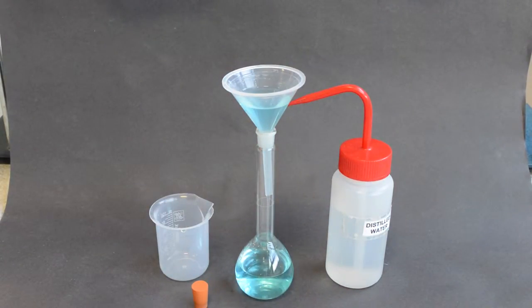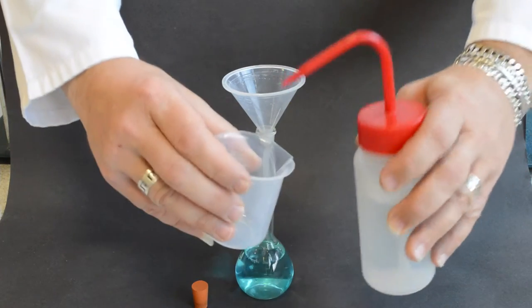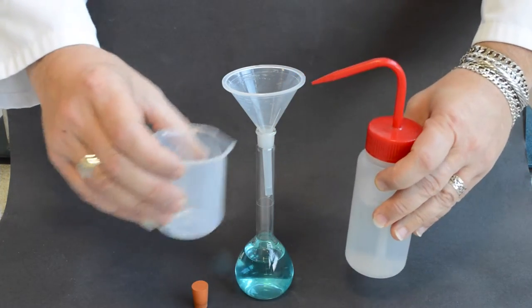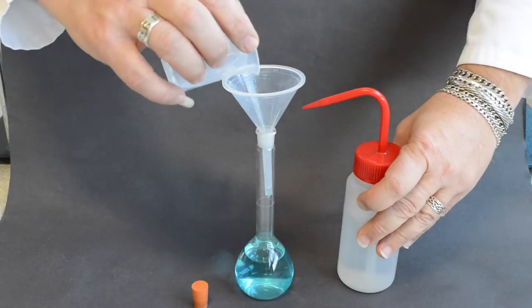To ensure that all the sample solution is transferred to the volumetric flask, wash out the 100 milliliter beaker with distilled water.